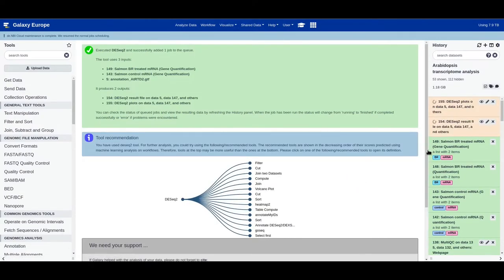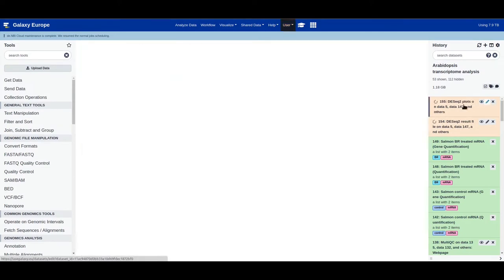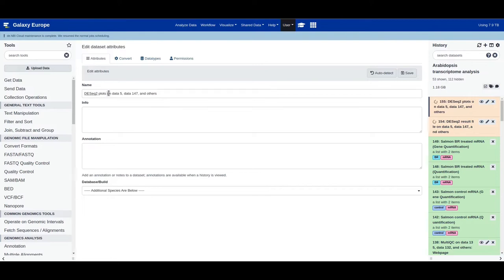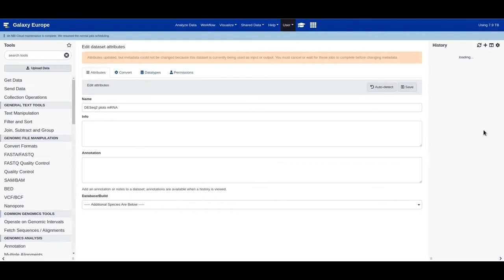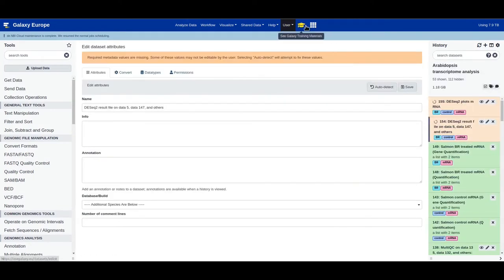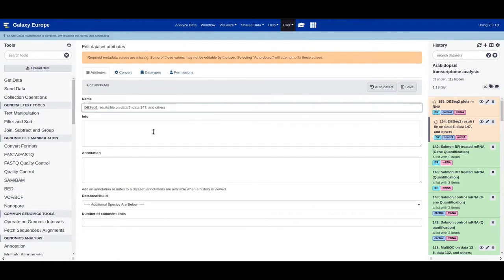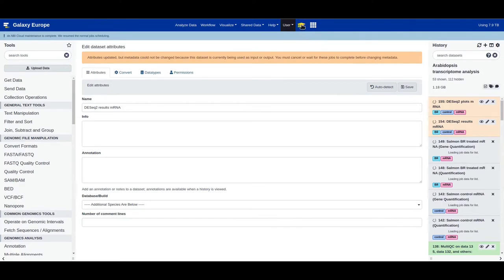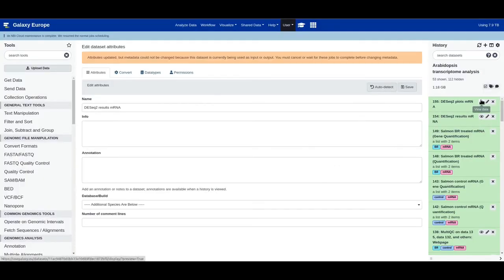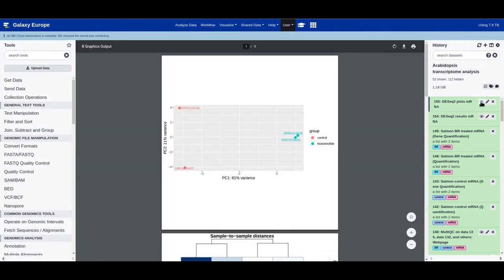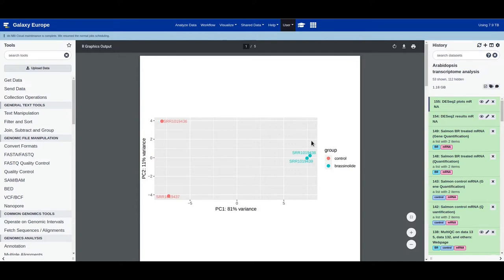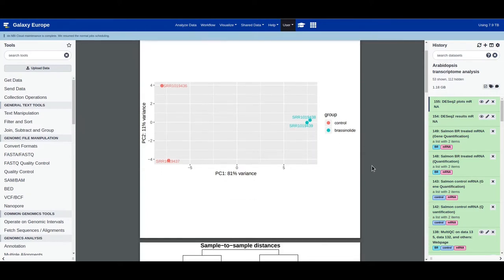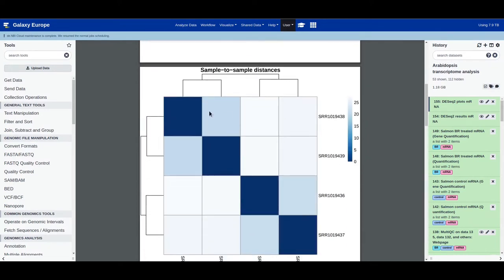While DESeq2 is running, let's rename the outputs — click edit attributes, change the name to 'DESeq2 plots mRNA', save it, then change the results file to 'DESeq2 results mRNA' and save. Let's inspect the DESeq2 plots. The first plot is a PCA plot — as you can see, samples from the same experimental conditions are clustered together, signifying high similarity between biological replicates. You can see the same trend in the heatmaps too.